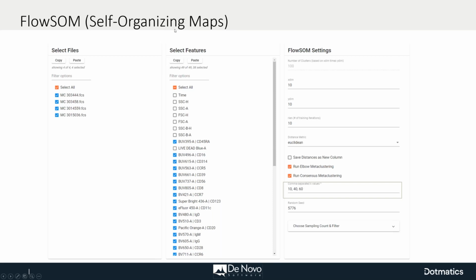Self-organizing maps come from outside of cytometry. There's a huge corpus of experience and information and materials out there about these algorithms. They're not just specialized flow tools. It just so happens that flow data is really well suited to the application of these tools. So it's definitely worth going out and exploring a little bit. And I have some links at the end of the presentation to give you some insight there.